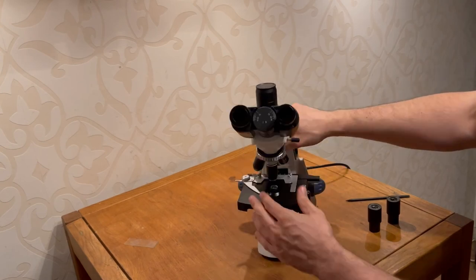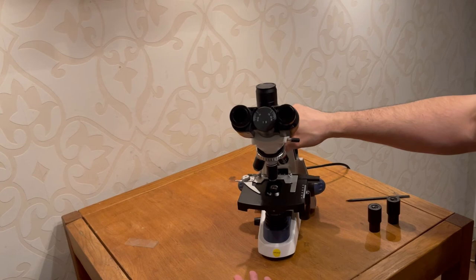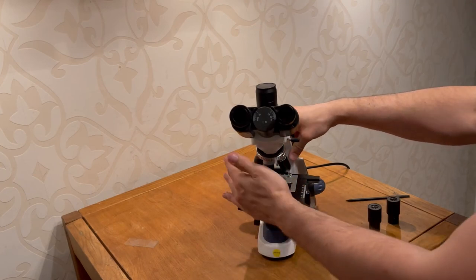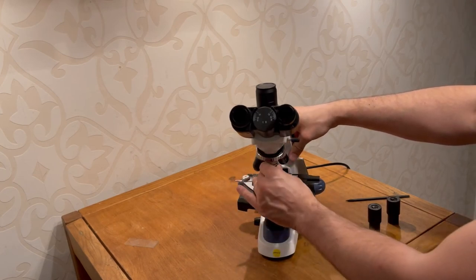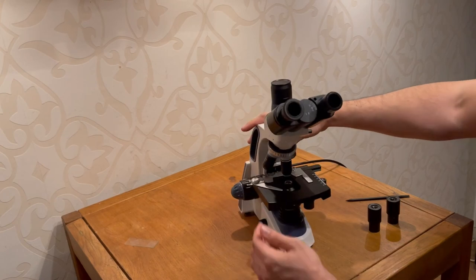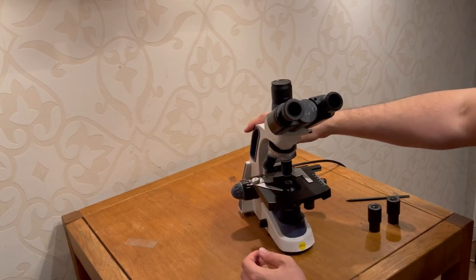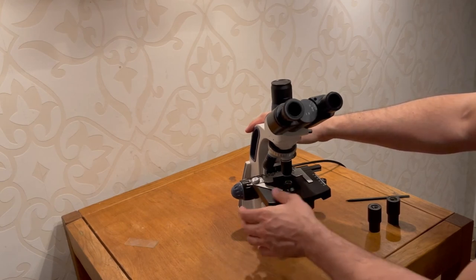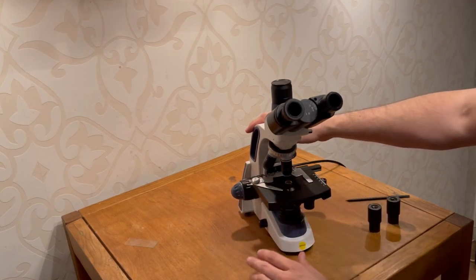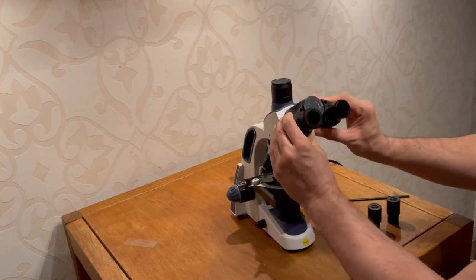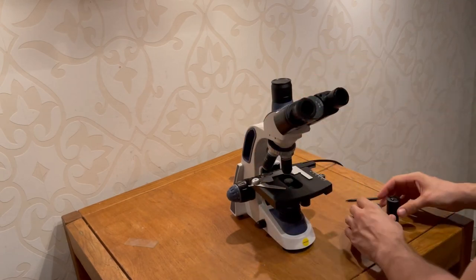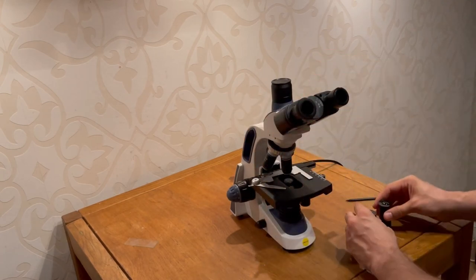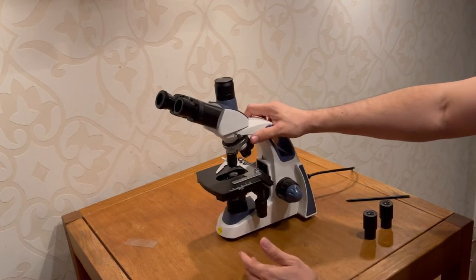The optical quality of the device is quite nice. The objectives are nice. The magnification, it's fine. I mean, we have the 100x oil objective. Could be replaced with 60x, probably. Because, I don't know, I will probably not use oil at all. The oculars are really good. And I mean, they are of a good optical quality. Everything else seems to be fine.